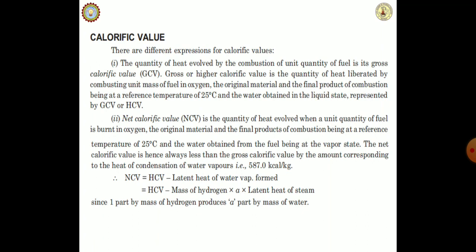Higher calorific value or gross calorific value is the quantity of heat evolved by the combustion of 1 unit quantity of fuel completely burnt with oxygen.